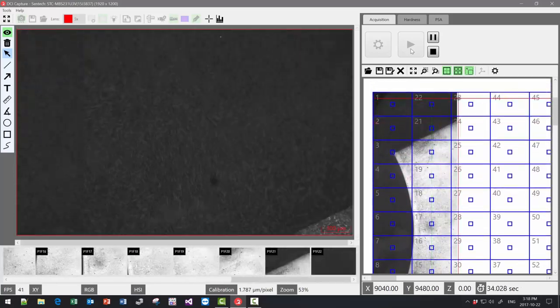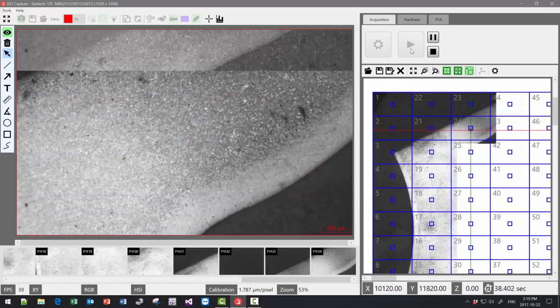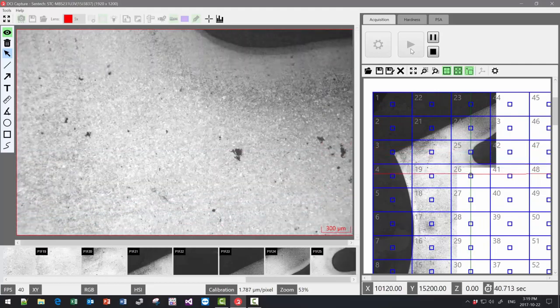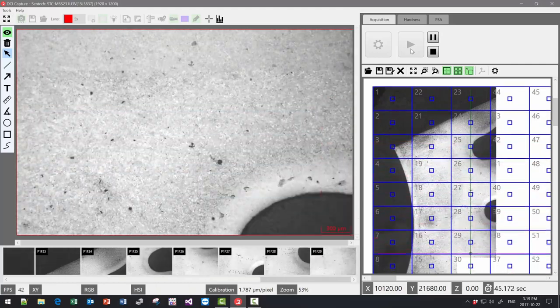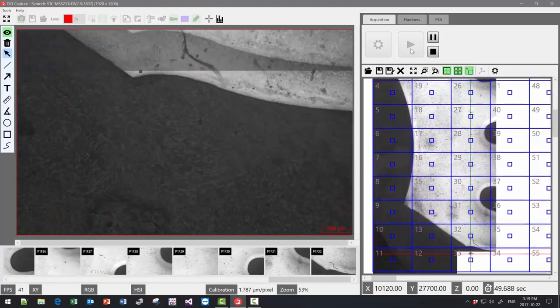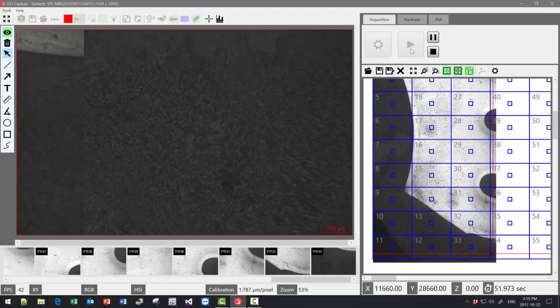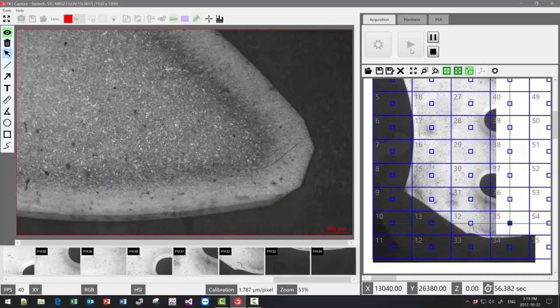The result is a microscope stage that possesses the benefit of the speed of a motorized stage at a cost closer to a conventional manual microscope stage.